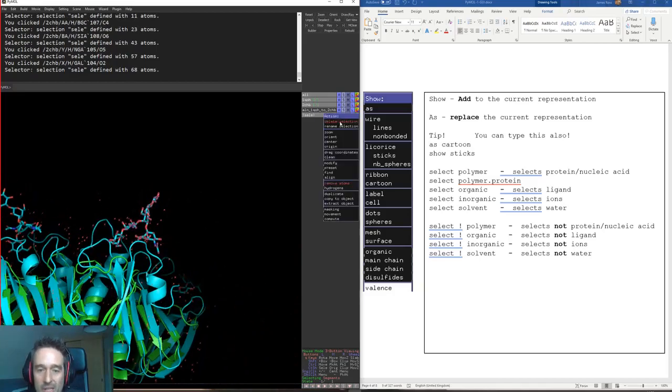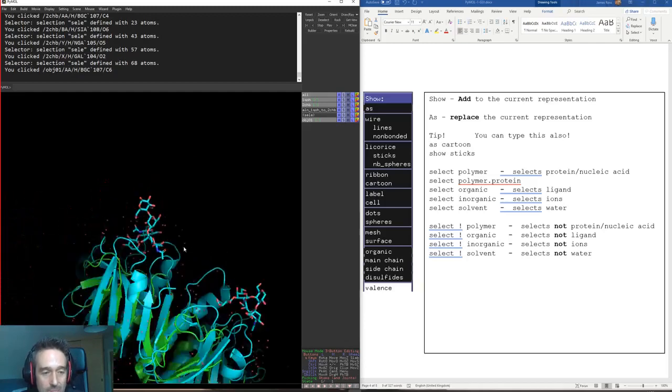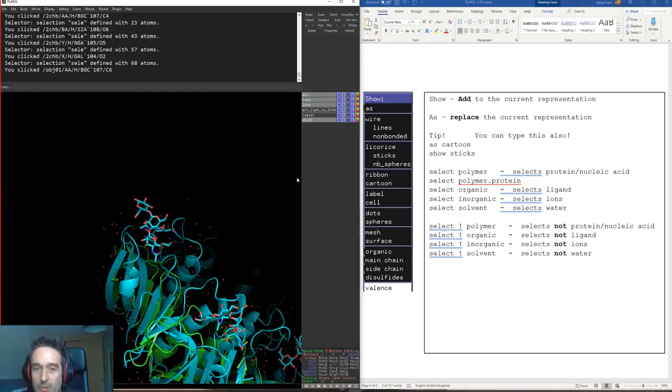What we can do on our selection is we can extract object, and now that object that I've selected is an independent object. And the good thing about it being an independent object, if you're doing any design work or something like that, in the editing mode we can shift and middle click and we can start moving this thing independently, which might be useful for you. So I don't think I need to talk about the action menu anymore.